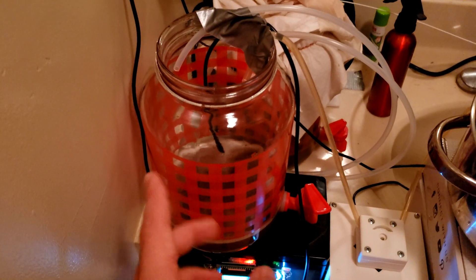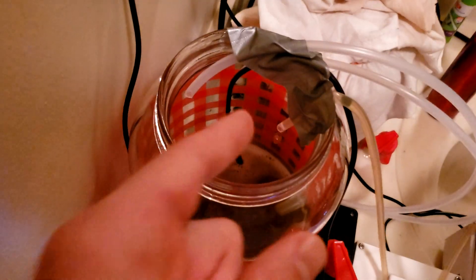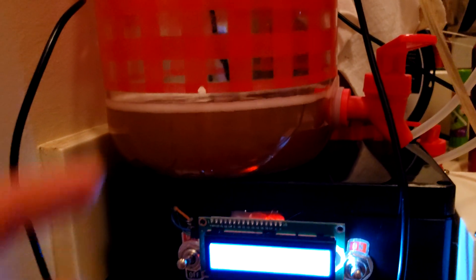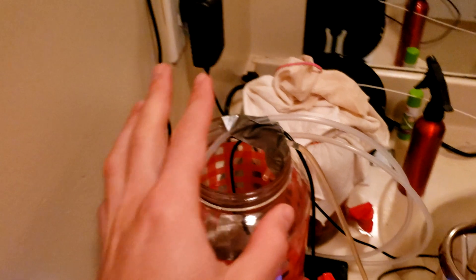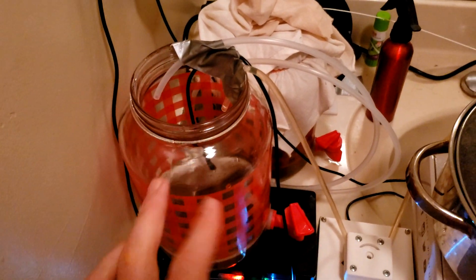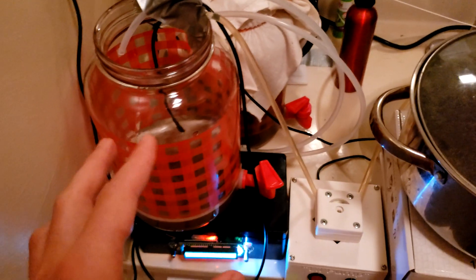This is working. The stir bar is working. The temperature is still working. The air pump is still flowing right there. We have our fed batch going right here. Here is the level right now. It's a little bit below this first line. I'm going to cover this up with the little towel. Let it run for probably 15 minutes. Come check on it and then evaluate from there.